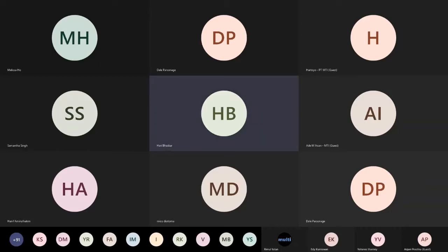Now, if you have a monitor and you are not using it, maybe it's a good time to check with our service guys on how to set that up. However, just a caution that you cannot set up the monitor for the first time several days after the calibration. So the monitor needs to be set up when the calibration is being set up.